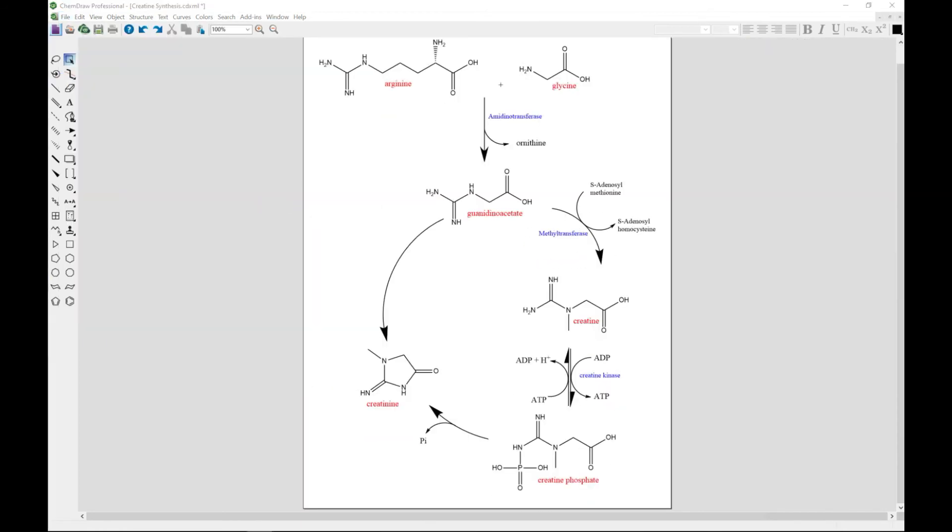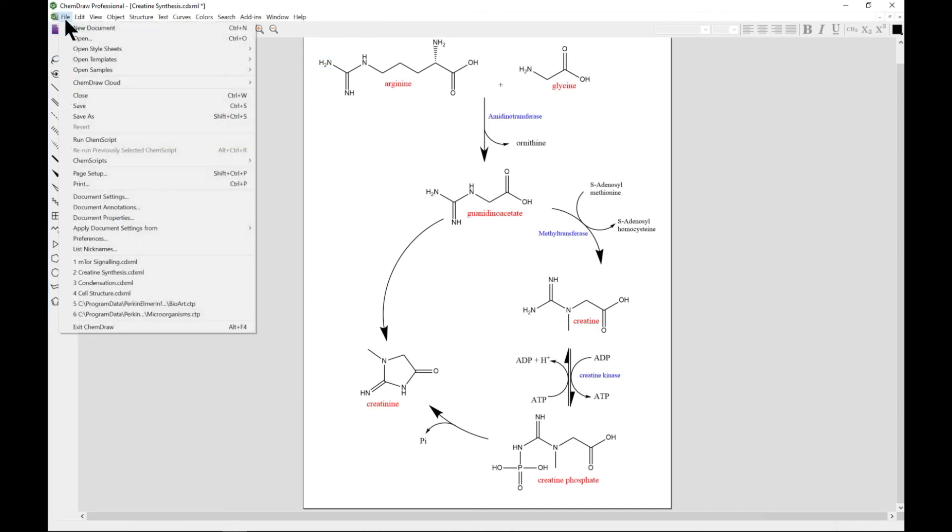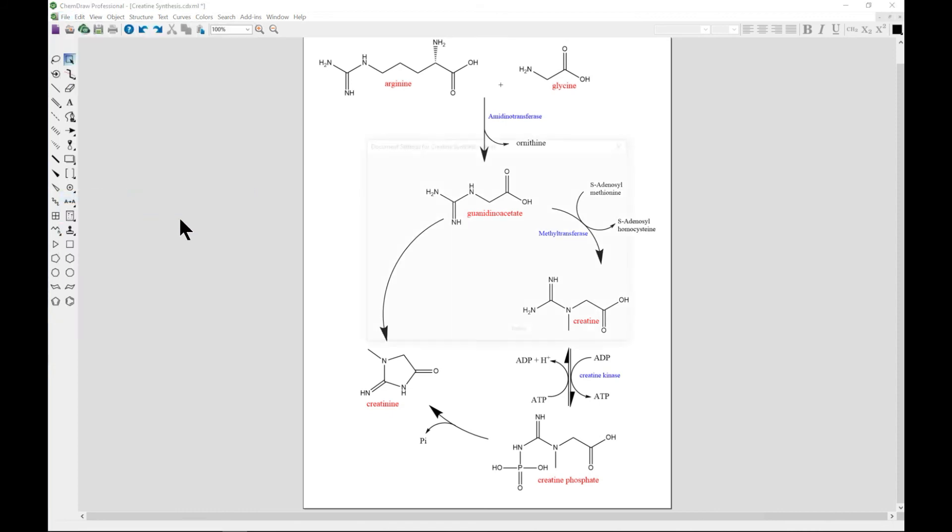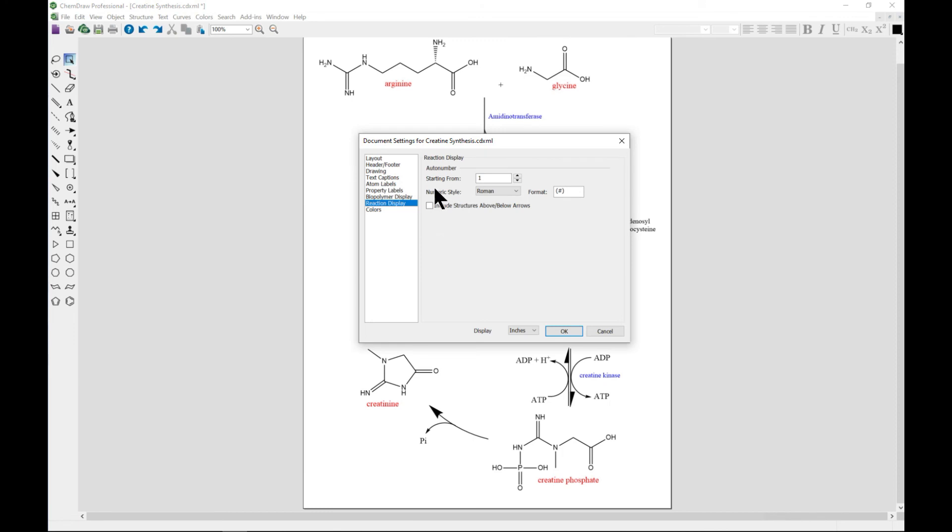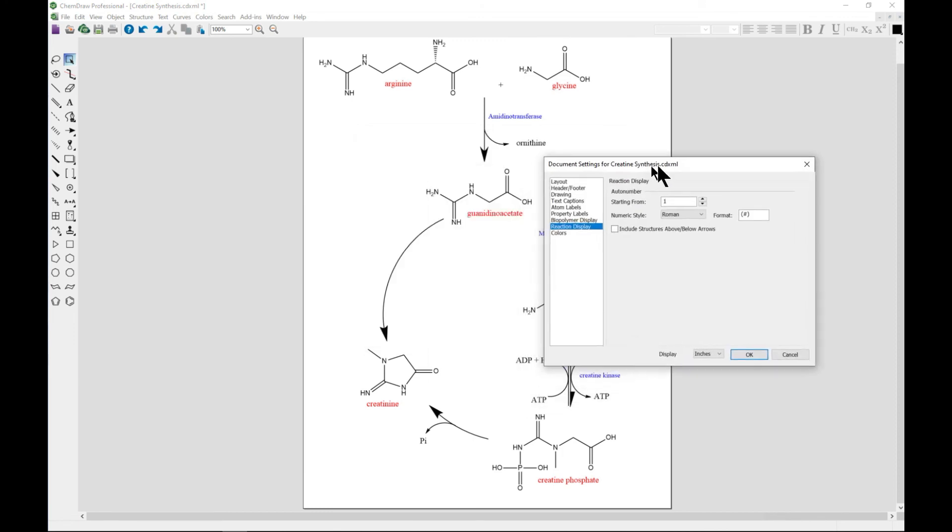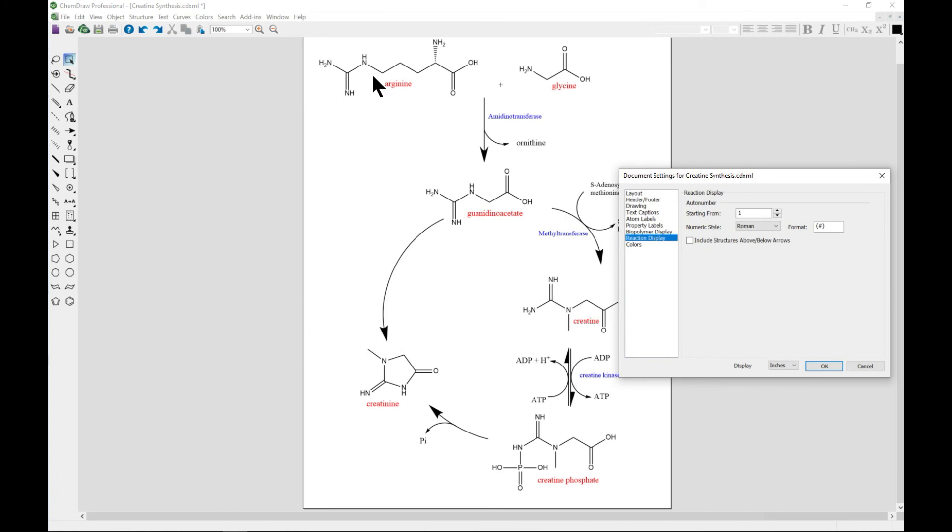Auto numbering reaction is also very important. Once you come to File, you can also come to Document Settings and add auto numbering to reactions. For instance, this is reaction one, two, three.